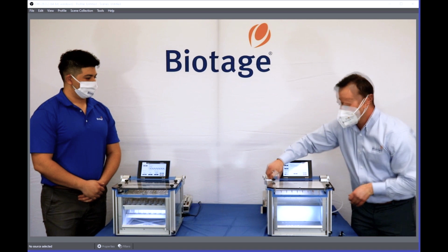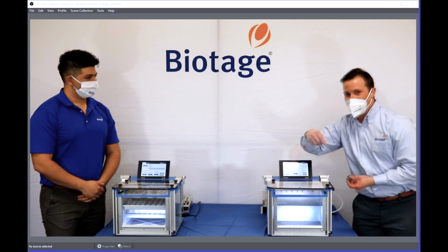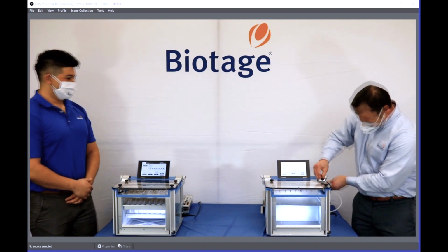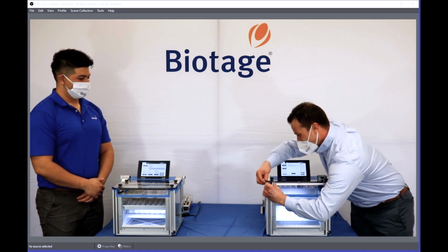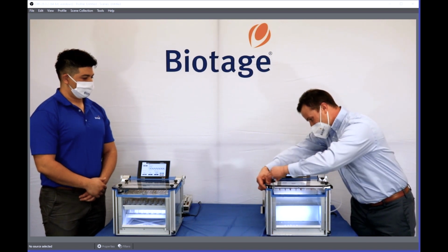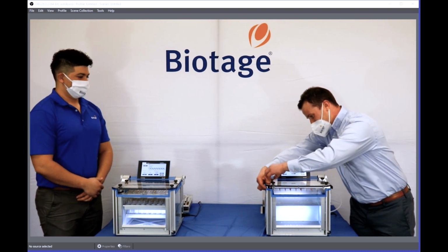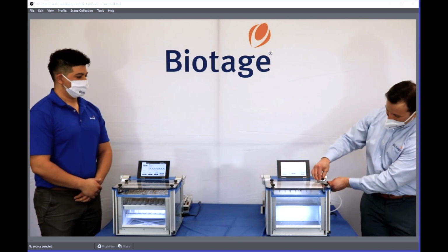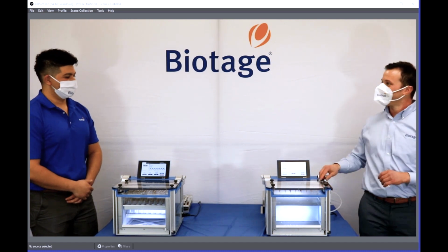Some of you out there probably I've been to your lab doing this before. If you're out there, I can do this faster. Leanne is walking the floor. All right, that only took me 6 minutes. That's really not long at all. And there we go. Now I have an LV. Perfect.